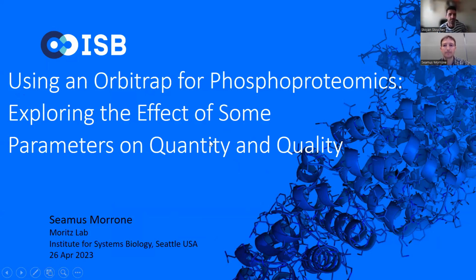Okay, so today I'm going to talk about the work that we've been doing on phosphoproteomics in Rob Moritz's lab, specifically using an Orbitrap instrument in DDA mode. And we're exploring some of the effects of the parameters on the quantity and quality of phosphopeptide identification.